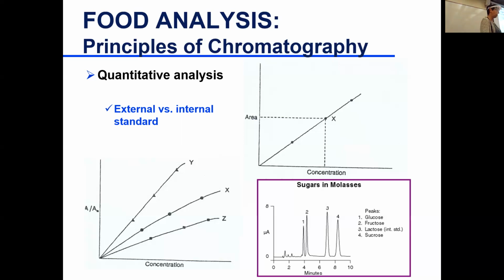So first of all, you saponify the fat, meaning you break down the triglycerides into fatty acids. And then you react the fatty acids with methanol, so you get methyl groups attached to the fatty acids. There's a lot of steps, a lot of reagents that you add, salt, hexane, a lot of reagents. You'll see that in the lab if you haven't done that. So at every step, there is a chance of loss. There is a chance of error.